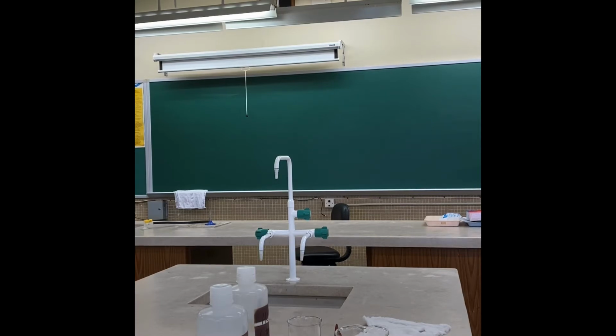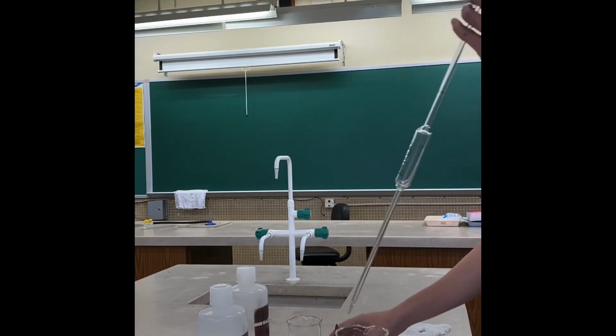First of all, we have to do some washing. Wash the pipette with some distilled water.